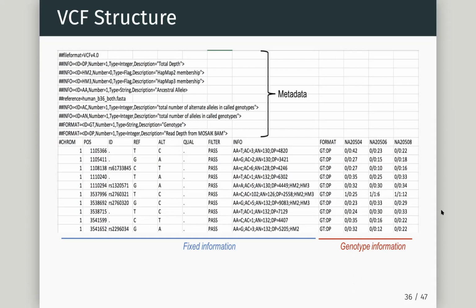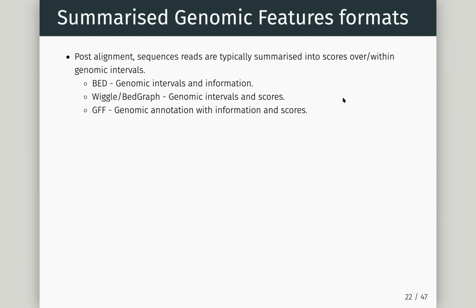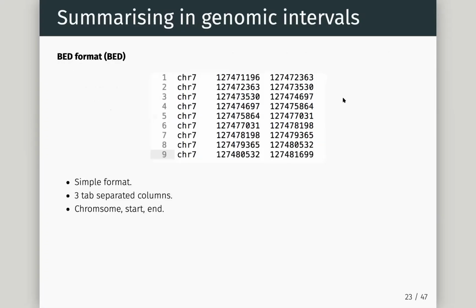Yes, so exactly, Carolina. If we were to go backwards again, once you've done FASTQ, you'll always start with, and you'll always go through SAM. The most basic format then is BED. Everything else I see as an extension of BED, right? This is our most simple. We have chromosome, start, end, and this is probably one of the first formats we saw in genomic sequencing.